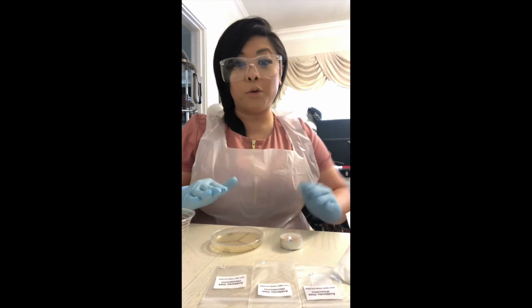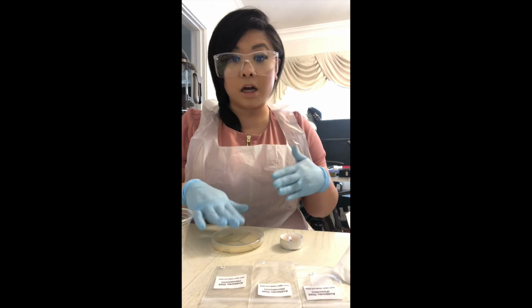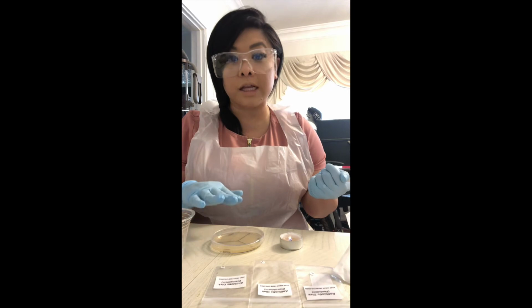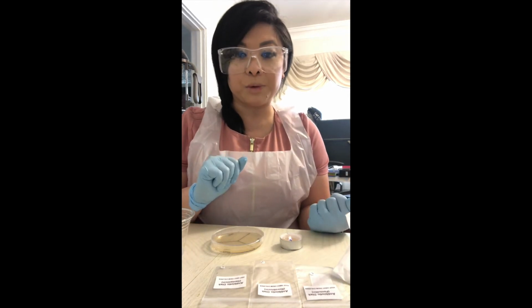Now I'm gonna allow my agar plate to sit undisturbed with lid side up approximately for about 1 to 2 hours until the broth is absorbed by the agar. Then I'll perform the rest of the experiment.